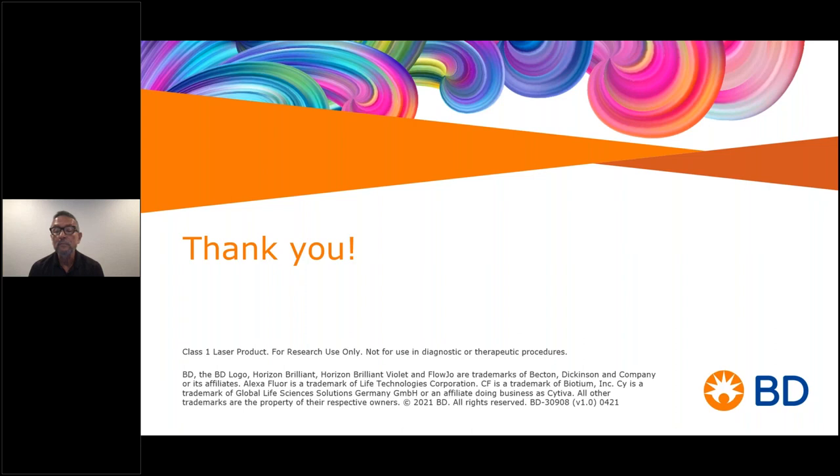So this will also allow you to see, if you're seeing a change in the performance of your assay, is it coming from your instrument, where maybe the laser power is changing or something is drifting? SSM will tell you that. Or is it coming from biology because your cell line has now changed its phenotype, has been activated? TSM will tell you that. So now you have both tools to really control your experiment and variation that could be either instrument related or biology related. But yes, if you compare the TSM across time points, you will be able to see the variation if the levels of expression are changing, which you will not be able to do with SSM.